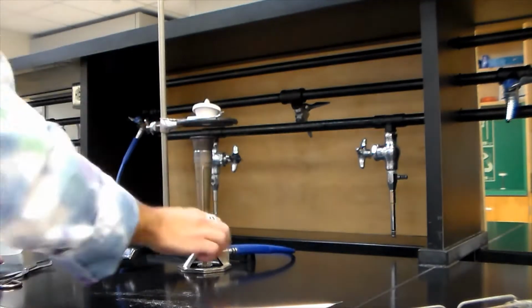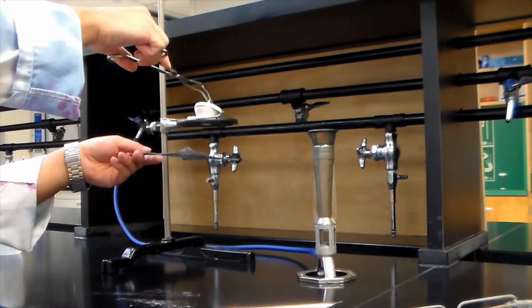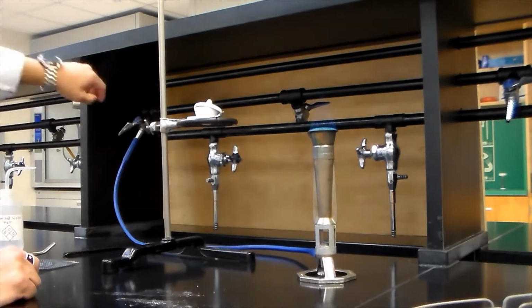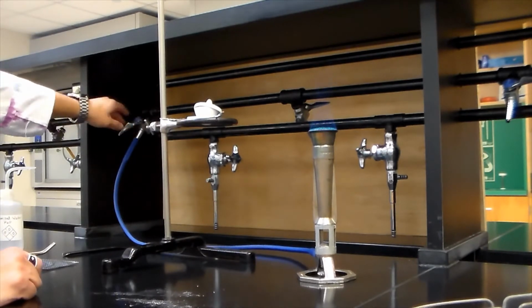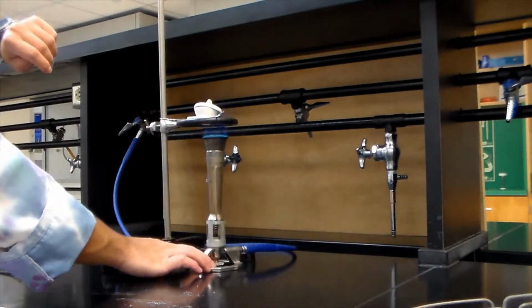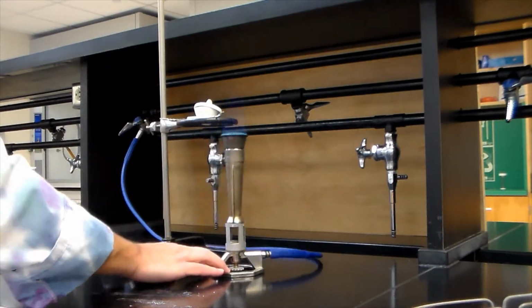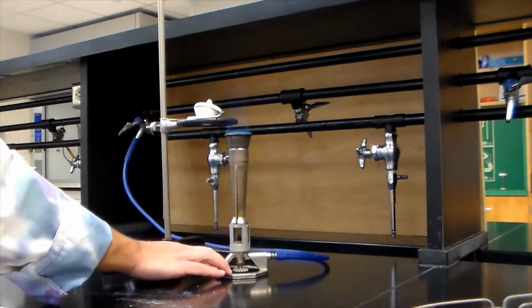Return the crucible with the magnesium ribbon to the iron ring. Slightly open the lid of the crucible to allow air to enter. Brush heat the crucible with a low flame for about 2 minutes. Continue to heat the slightly open crucible with direct heat for another 5 minutes with a flame of medium-low intensity.